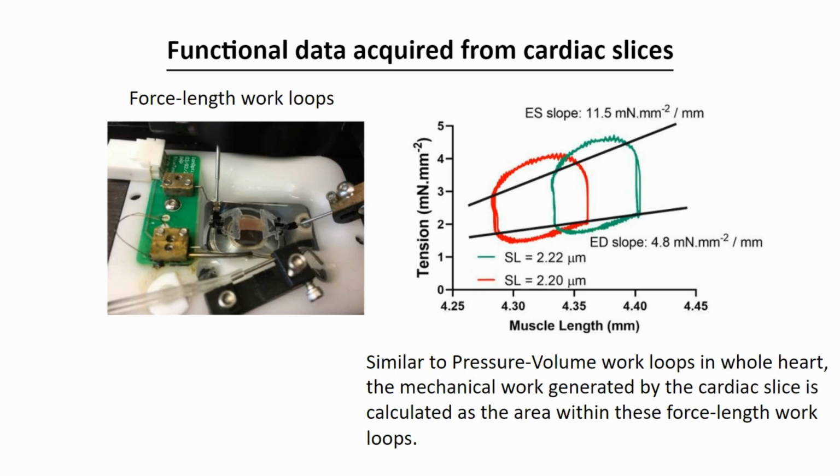With this methodology and the use of the cardiac slice, myocardial performance through the cardiac cycle can be examined without a fully instrumented animal or isolated heart, and the slice offers control of sarcomere length and other conditions that are not possible in other experimental model systems.